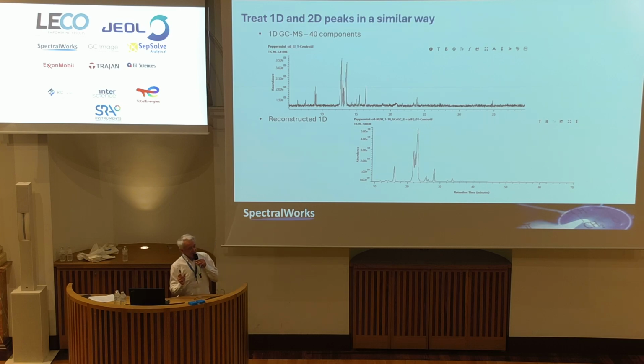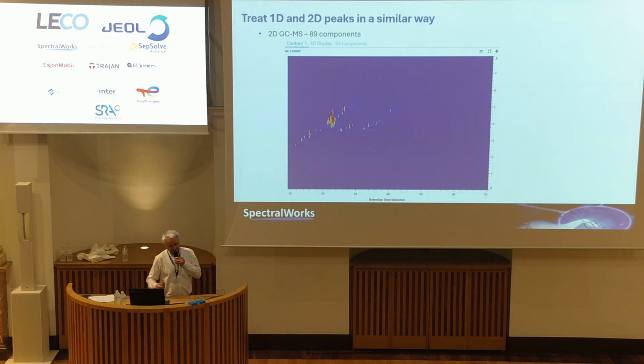And we're actually beginning to lose resolution on the first dimension. But we can plot this in our normal contour plot, and we probably find that we've got 2 or 3 times the number of components that we're able to split.